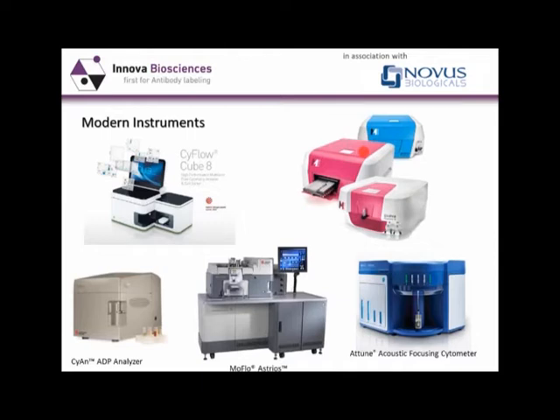And actually the development of the machines, although they've gone down the route of making these instruments extremely accessible to the user, the ease of use has to be treated with caution, because it doesn't replace the need for understanding the principles behind flow cytometry and the need for the appropriate control experiments and control samples within each of those experiments.